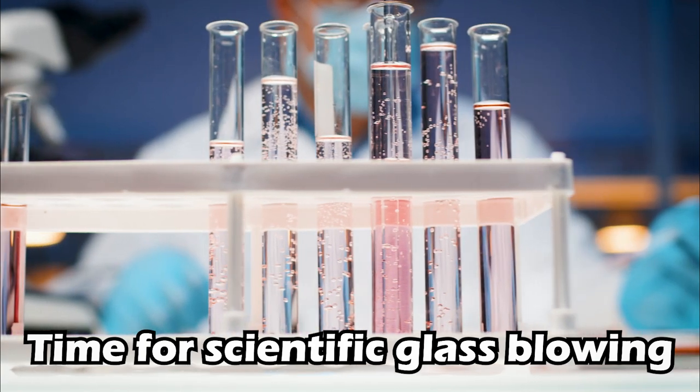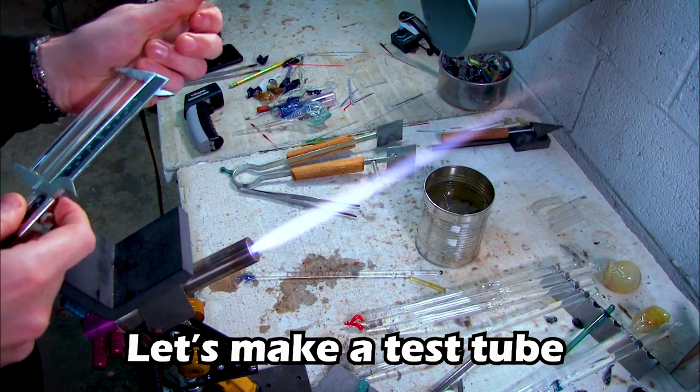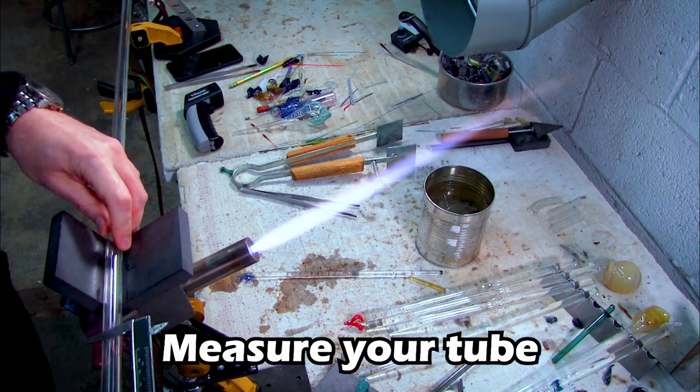Test tubes — those small round glass things we see in laboratories. I'm sure you've used one or two at some point in your life, but have you ever seen how they are made? Well, sit tight because you're about to find out. Join me as I show how test tubes are made by hand.